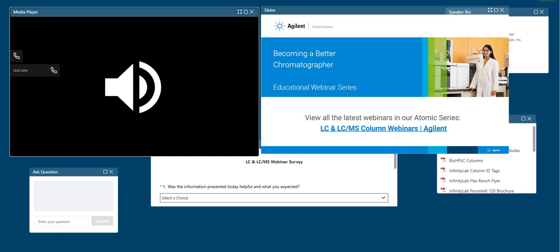It's not recommended. We'll always tell you that if you're working with a mixed bed column, it's best to use a linear column with a linear column. With that, if you look at the calibration plots of these columns, those calibration plots are going to be similar. If you remember back to the slide that I showed that showed combining individual pore columns where the slopes of the columns were different from one another, if you tried to combine those 2 columns, you're going to have a mismatch between them. And that's what can happen with combining, say, a linear and a mixed column with an individual pore column.